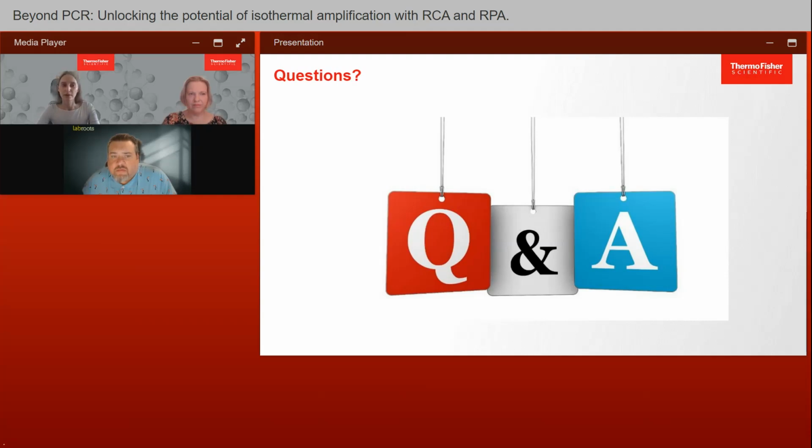So yes, there are several modifications, but basically you have to think whether the structure or components of the reaction can somehow interfere with your application. And if so, you can do either purification, debranching or digestion of your RCA products.